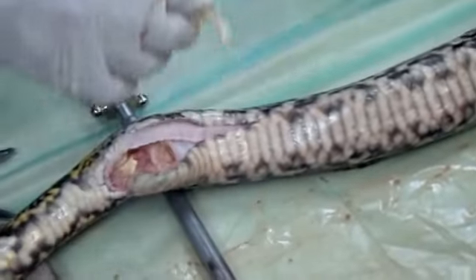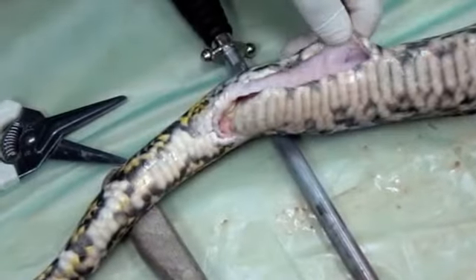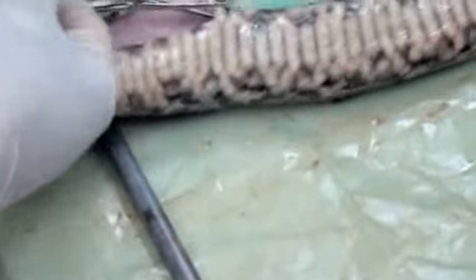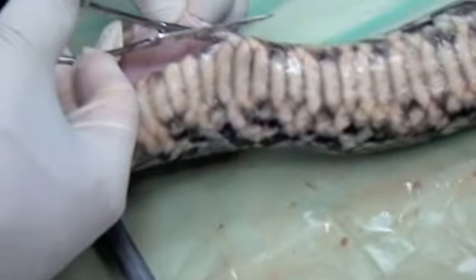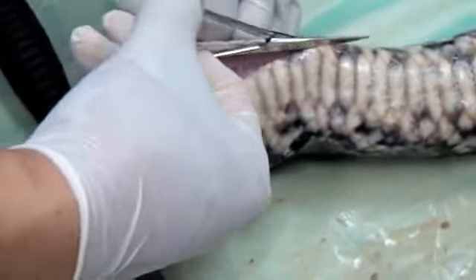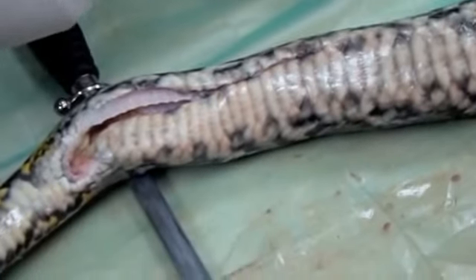Did you all hear that? You want to open it up and slip the point, see if that one actually cuts better. Yeah, you want to slip the point into the fat area and lift it up away from the body, because if you cut open the belly and the bowel and all that, you're going to get a waft of really strong smell.